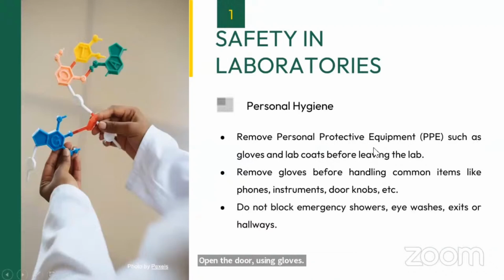Do not block emergency showers, eye washes, exits, and hallways. Many times I have come across laboratories that are very congested and cramped. Then what they do is put some materials, some store items, in front of emergency exits or near some shower.